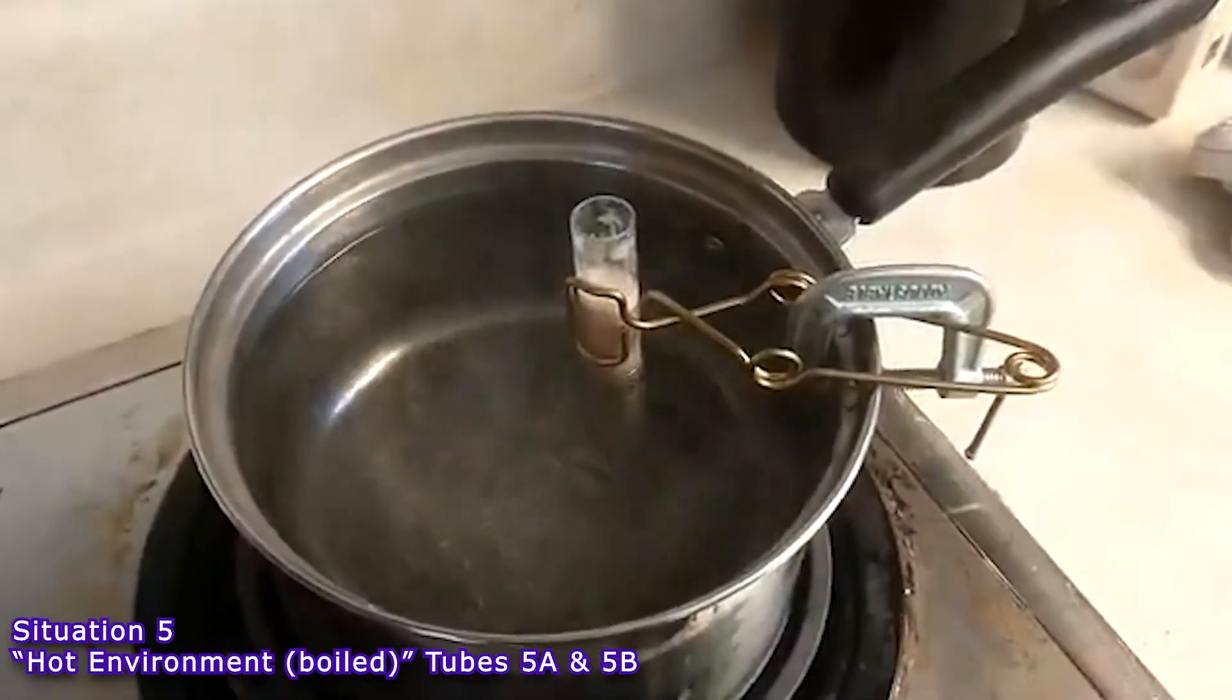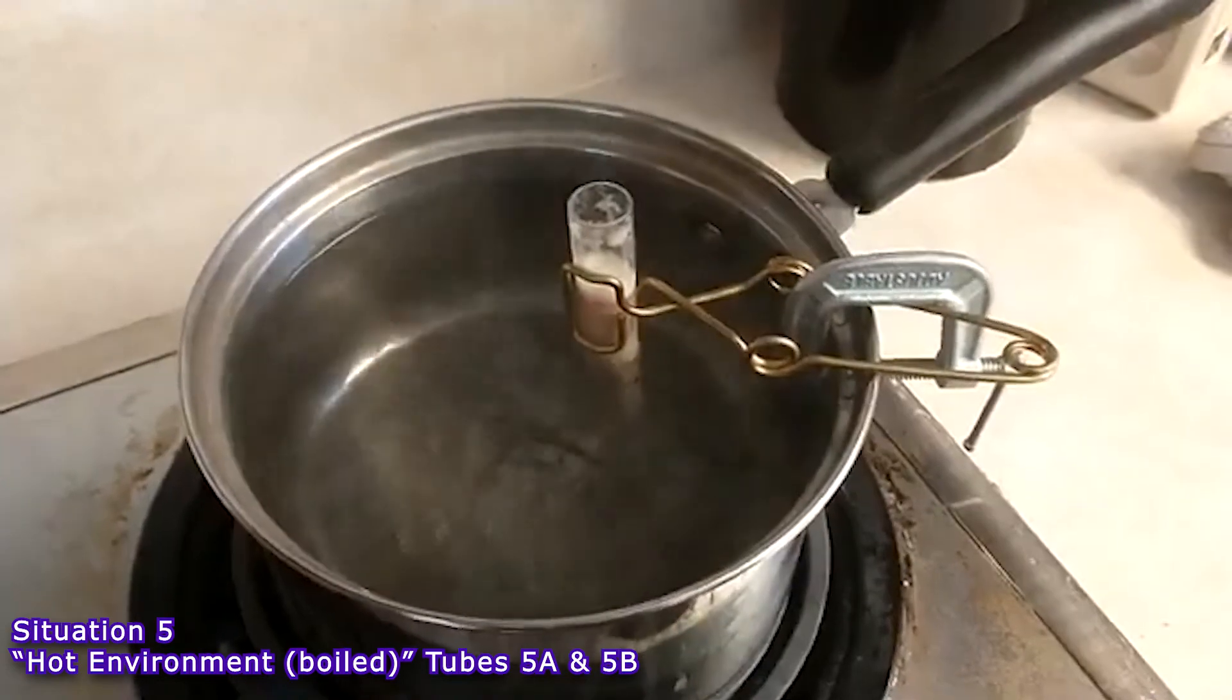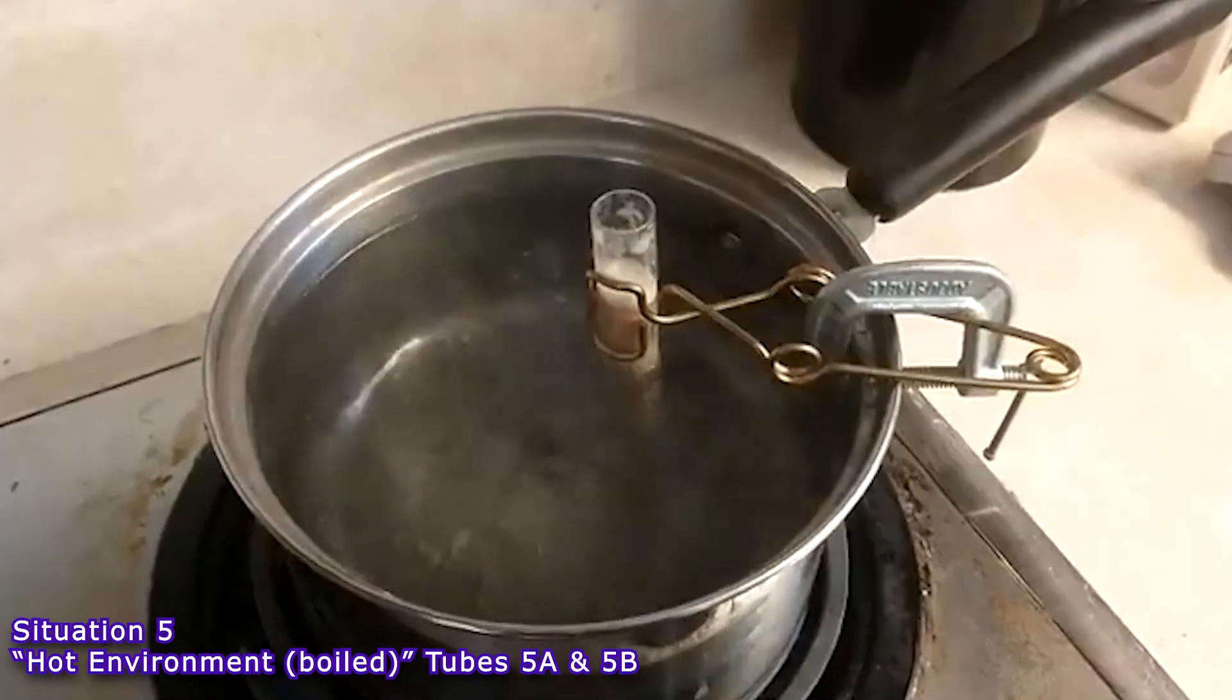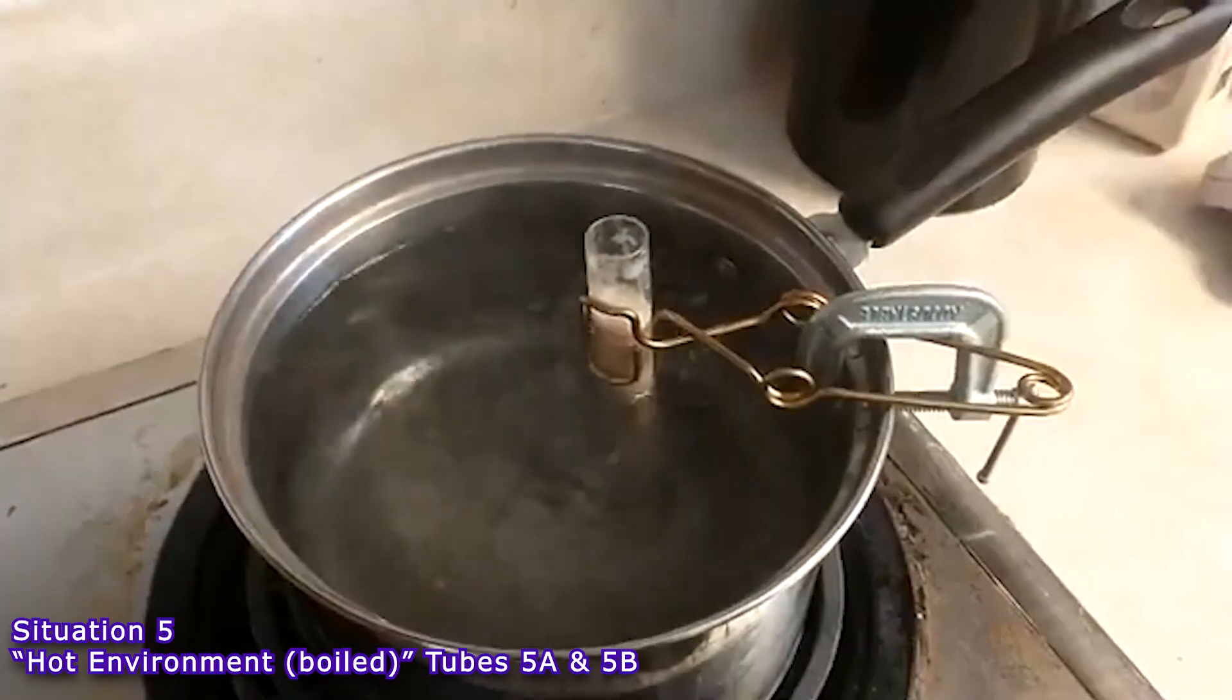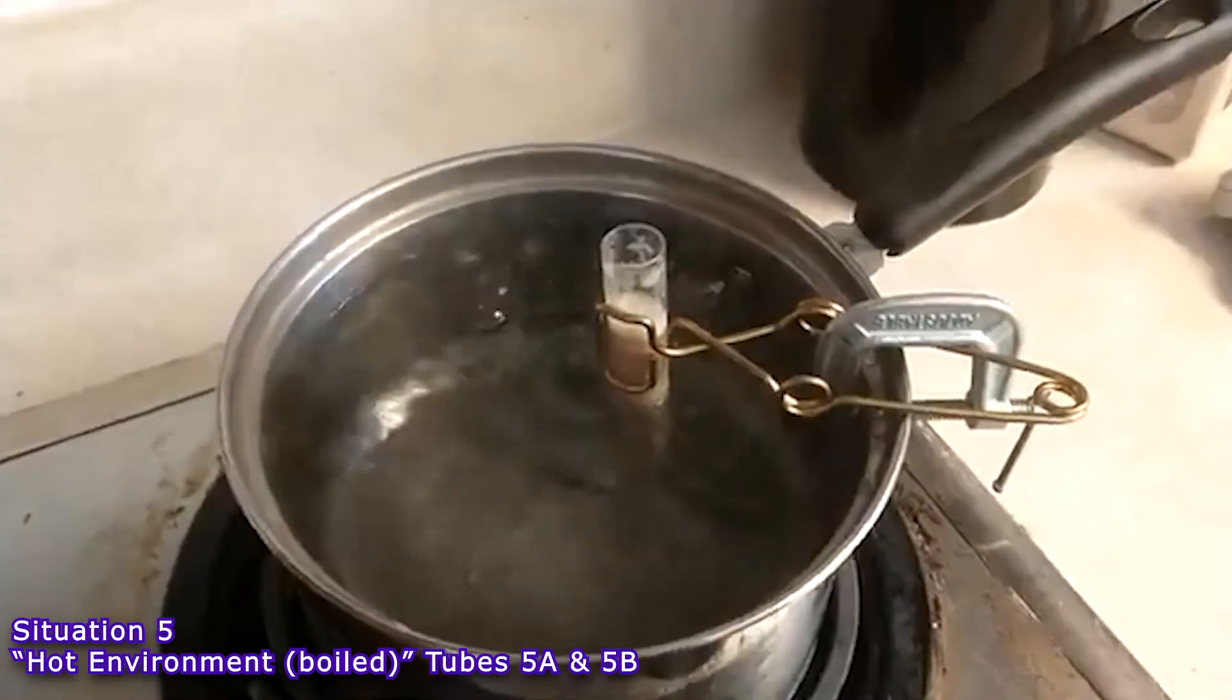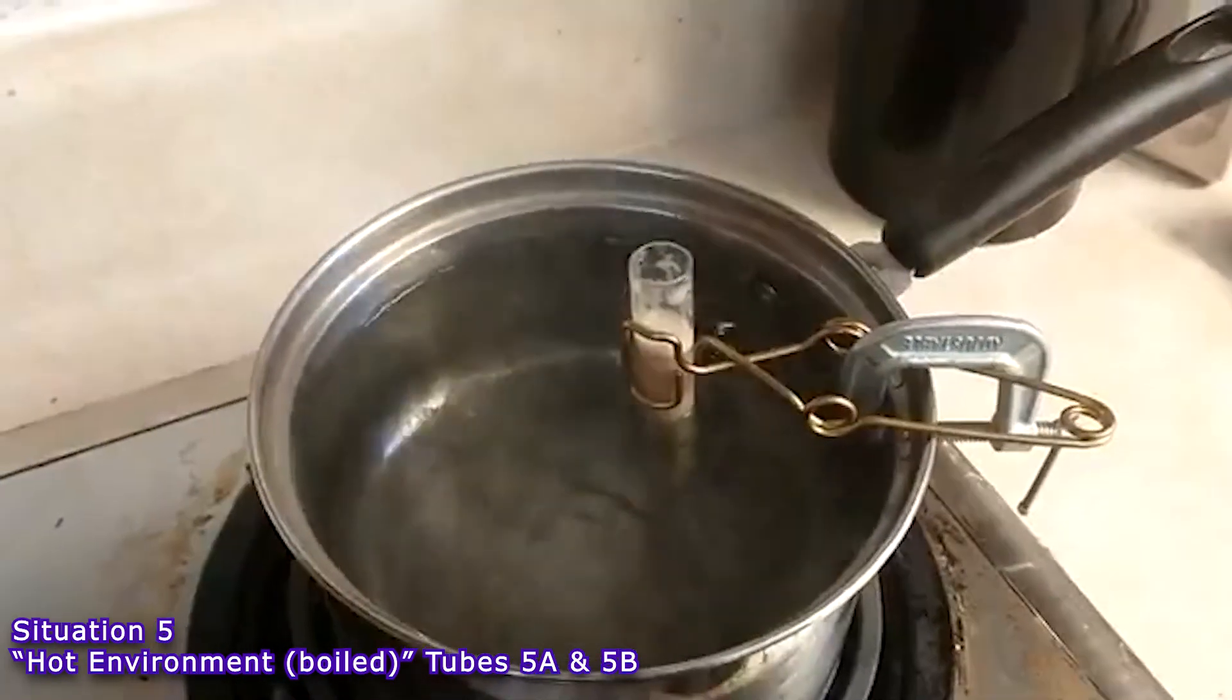Situation 5 is checking what happens when we boil the liver homogenate. So, for 5 minutes, I put a sample of liver homogenate on boil to see what would happen to the catalase enzyme in that environment. So, you'll notice that the sample of homogenate has a very different texture and color when I add it to tubes 5A and 5B.